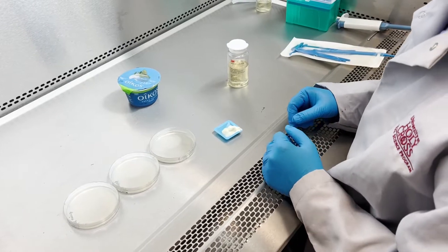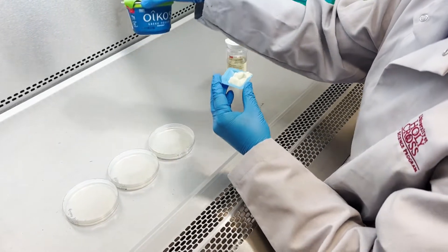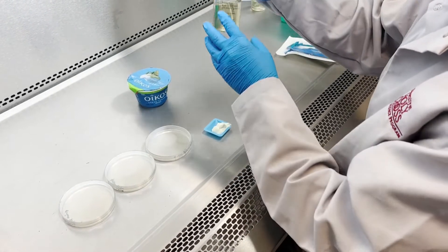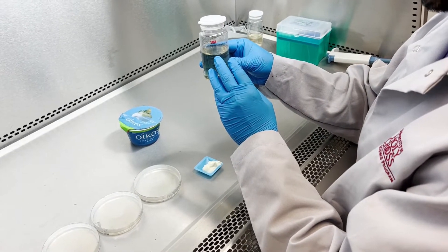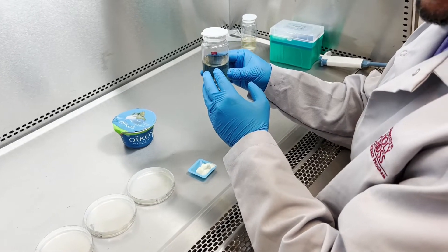Now I'm going to take 10 grams of yogurt sample and mix it in 90 ml of peptone water. We use peptone water because it balances the nutrients and electrolytes for maximum or optimal growth.